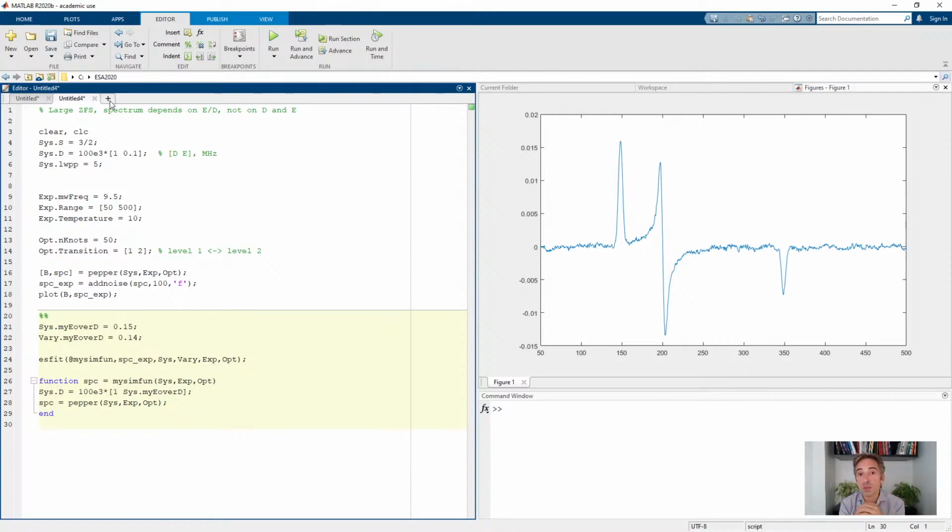Another one is microwave phase. When we tune the spectrometer, we typically adjust the phase to within a degree or 2. But if you do very, very careful line shape analysis, those few degrees offset will distort your line just minimally, and you might want to correct for that. So you could fit the microwave phase.